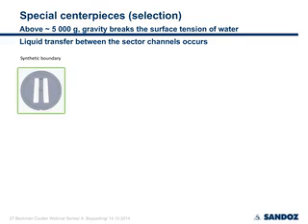For example, if you consider a synthetic boundary, this is quite useful for the determination of the extinction coefficient and vice versa of the concentration. I will show you an example of determining the extinction coefficient in the next slide, which is a quite tricky task sometimes.